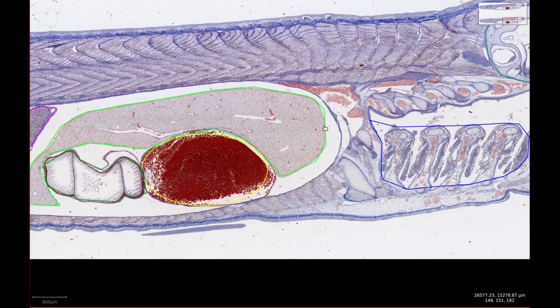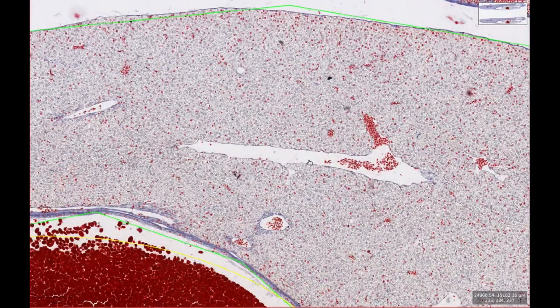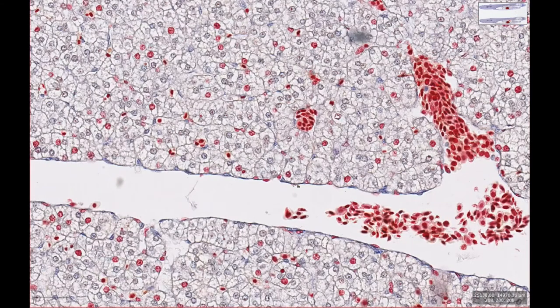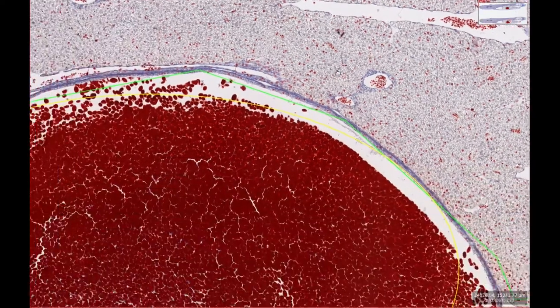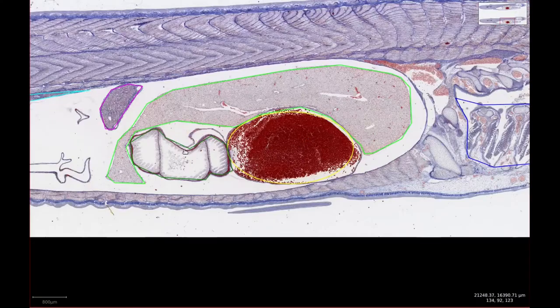The coelomic cavity has changed as well. Now it's dominated by the liver, which has good cellular detail. You can see large blood vessels dissecting between lobules of large cells with round nuclei and clear vacuolated cytoplasm. Ventral to the liver there is a smaller section of the yolk sac, which is in close proximity to some colon.